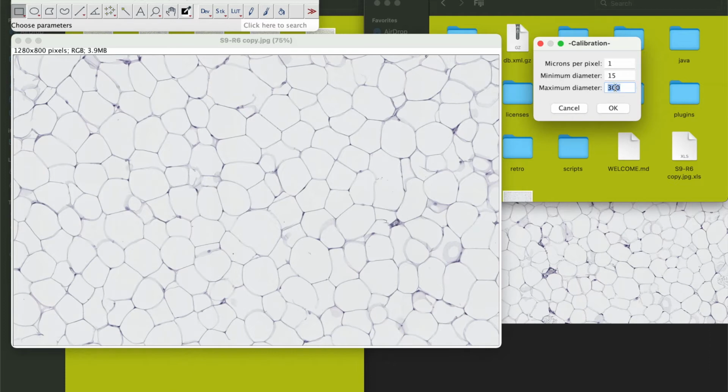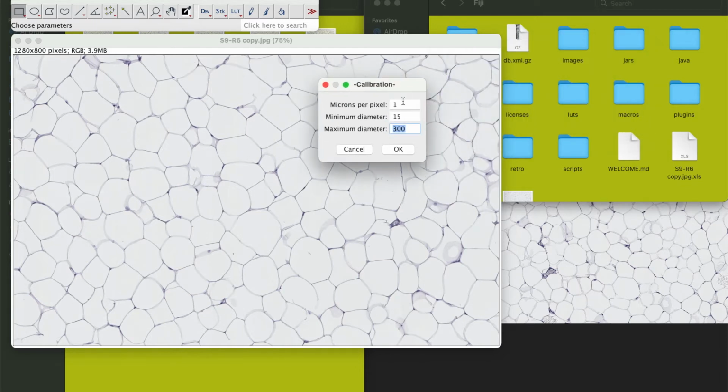But usually you can keep this number pretty high. It should recognize this as two different cells. But sometimes when the lines aren't as clear, it might mistake this for one big cell or something, and then you might want to tone this down. But I found these values to be good, so you could probably try this out and then put your own values in there.